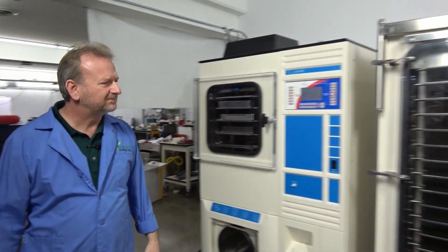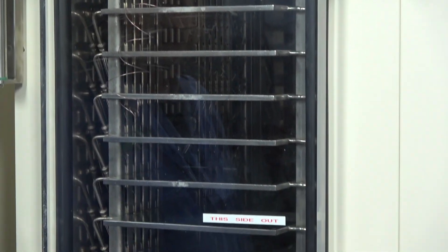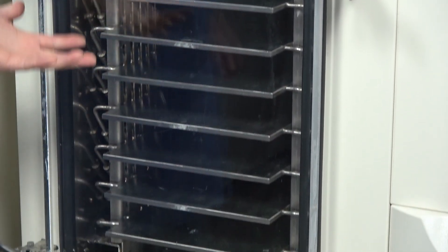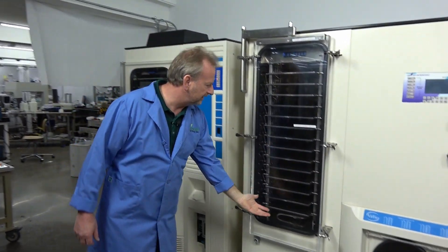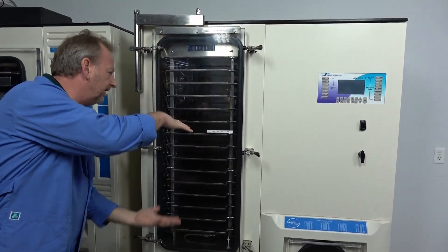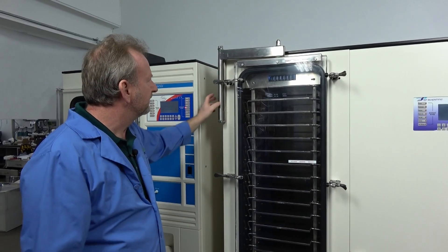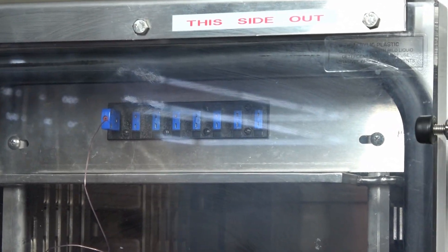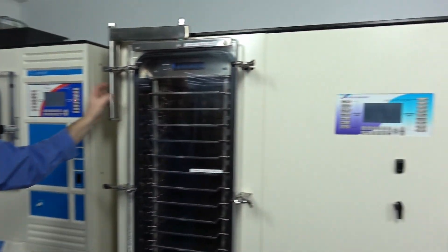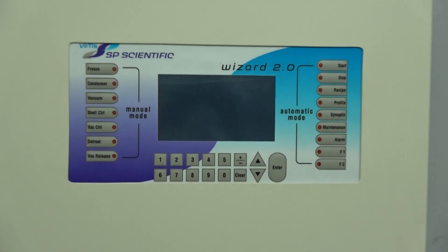Stepping over to the Ultra model, you can see it's got a load of shelves in it. This one has a stop ring built in with a hydraulic cylinder in the bottom pushing all the shelves up and clamping your samples in place — stoppered. This one also has up to eight different channels to read your product temperatures down on the shelves, and the Wizard 2.0 gives you the capability to read all eight channels.